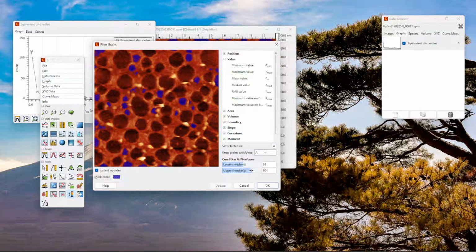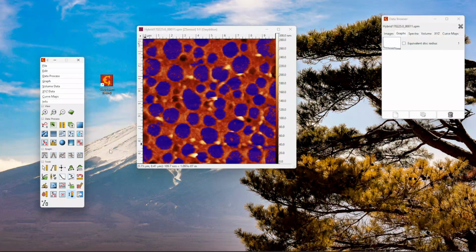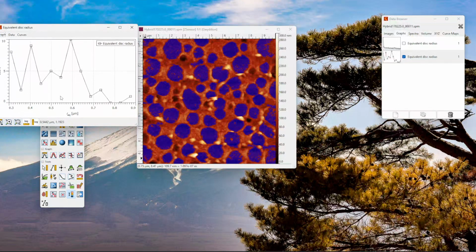You see, maybe this is the upper limit, and maybe some of those are not the holes that you would like. So maybe we can do it in reverse, and select just the big holes or something like that. You can do it by this, and then run the analysis once again because they are in your image. And you see it's quite different.